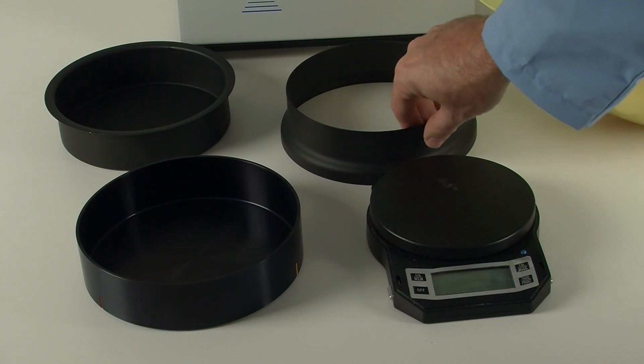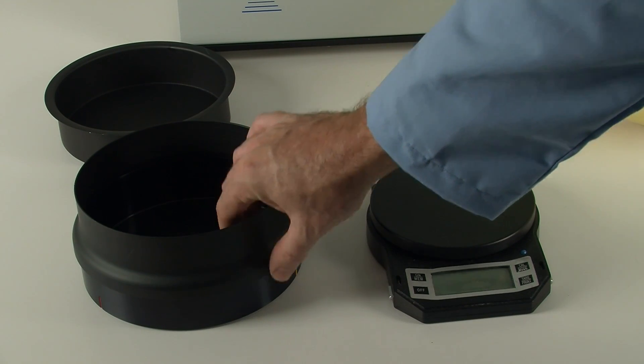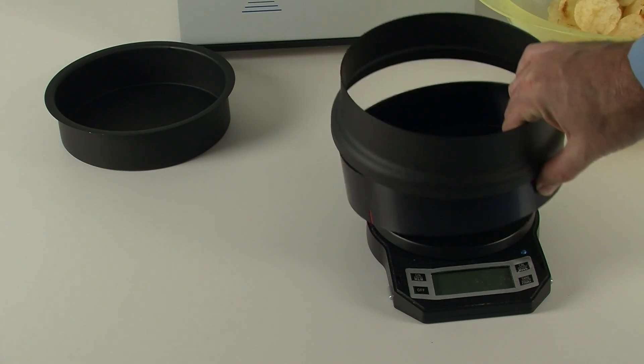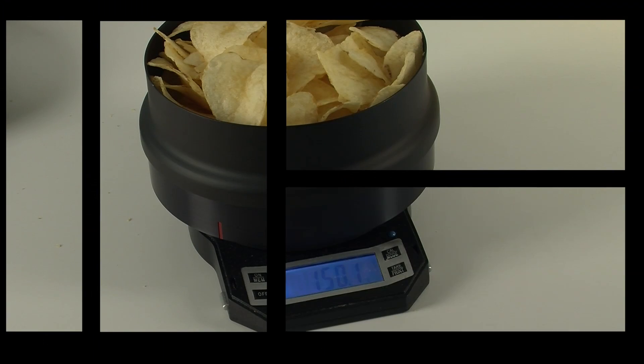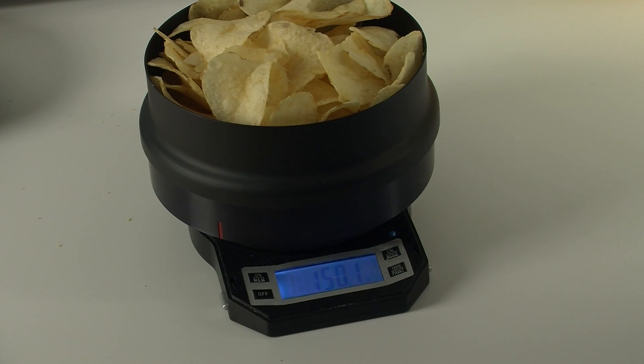Place the compression ring on top of the sample dish and place that on your scale. Turn on your scale and zero out. Place 150 grams of the product in the sample dish.